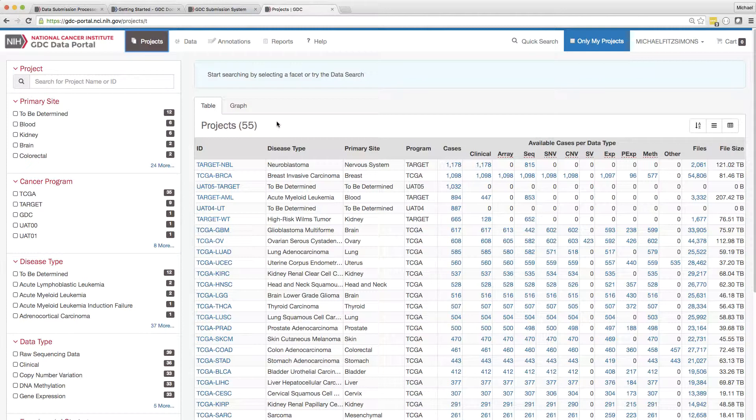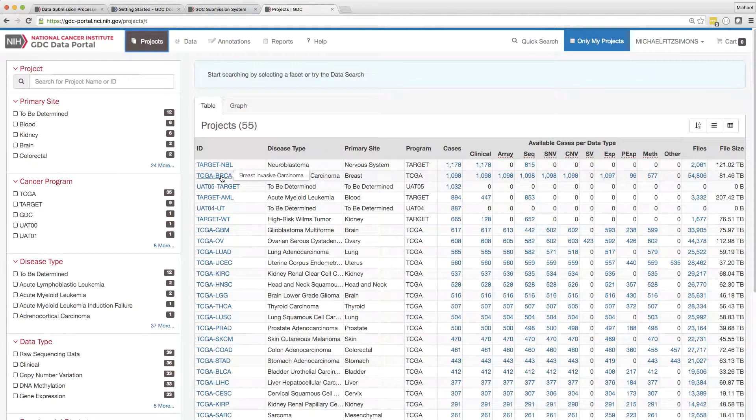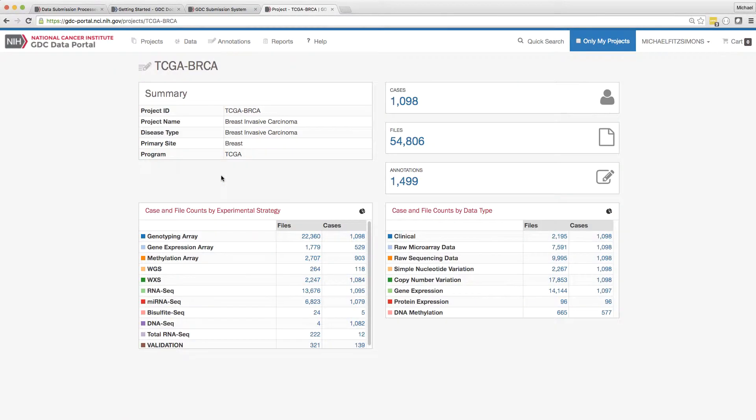Perhaps I am interested in specific files within the TCGA BRCA project that relate to copy number variation.